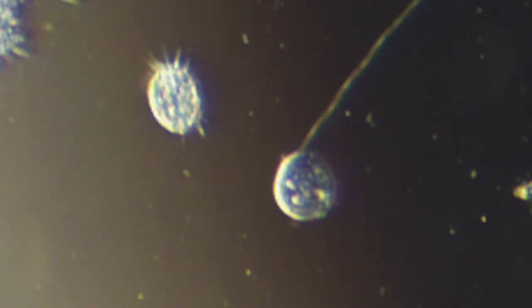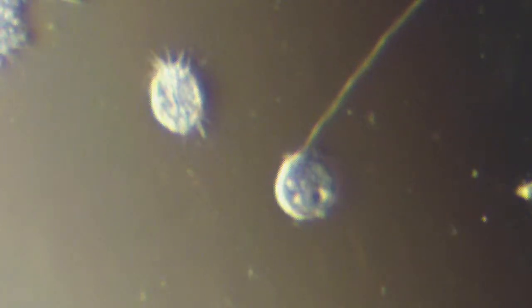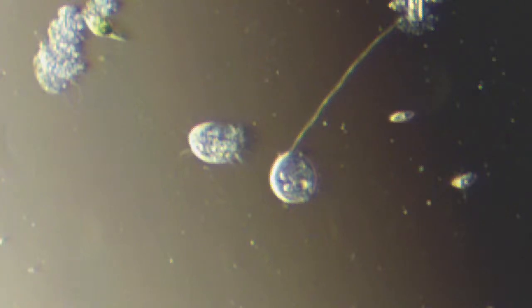Let's get a little dark field action. Oblique lighting, so that you can see a little more activity inside the Vorticella. I'm digitally zoomed a little too much. I'm losing some sharpness. And here comes another little guy to join the party. So we got Euglena on the upper left. Another little visitor here I'm not familiar with. Some kind of little flagellate. And the two guys in the middle. It's quite a nice little gathering.